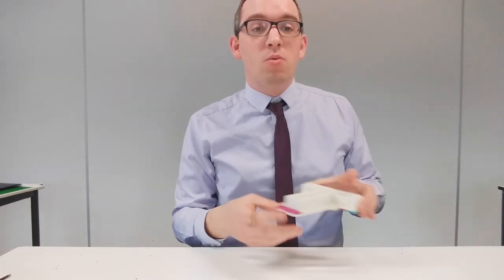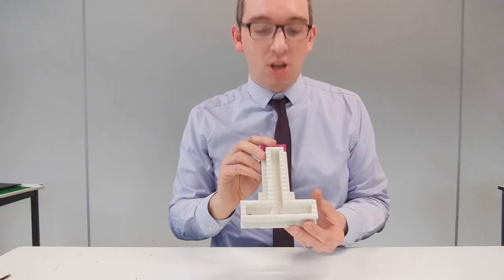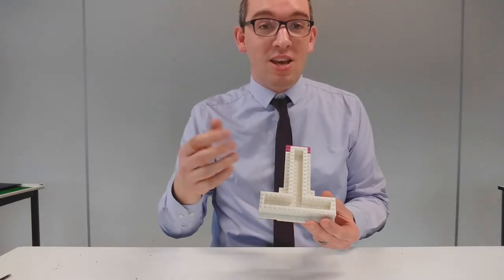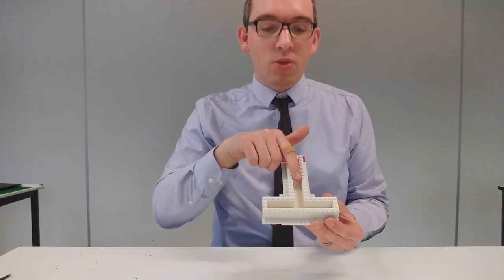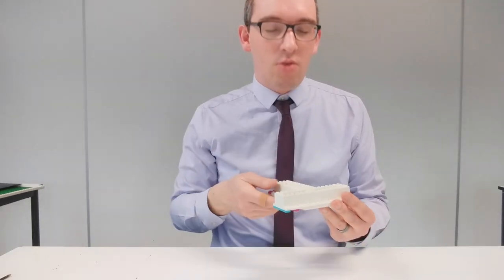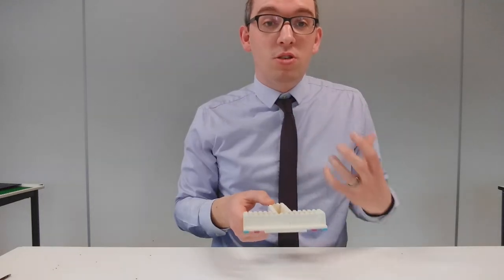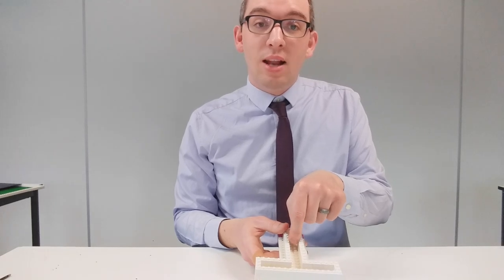Now, in this experiment, you're going to have a look at whether wood lice prefer certain conditions or not. So, what I've made here is what's called a T-shaped maze. And a T-shaped maze is a maze in the shape of a T. So we've got a starting point here at the bottom, base of the letter T, and then when the wood lice walks to the end, it's got a choice. It can either turn left or it can turn right. And what you're going to do is you're going to put a single wood louse at the beginning of the maze and you're going to let it crawl.